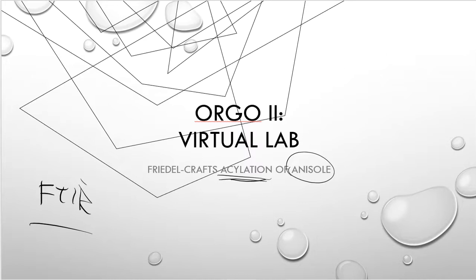Aren't you excited? Okay, well, without going any further into the lab, I want to take some time and talk about some of the basics that will be happening with this particular lab experiment. The very first thing that I want to focus on: it says Friedel-Crafts Acylation of Anisole, right? So I'm going to have to go back and remember what the structure of anisole actually was. And I hope that you can do this without looking it up, because this was one of those molecular structures that we wanted you to memorize.